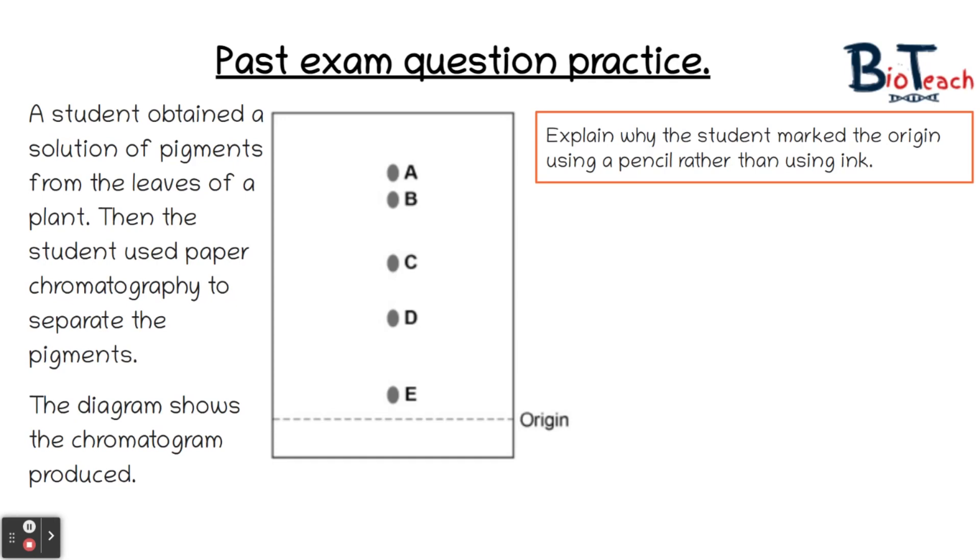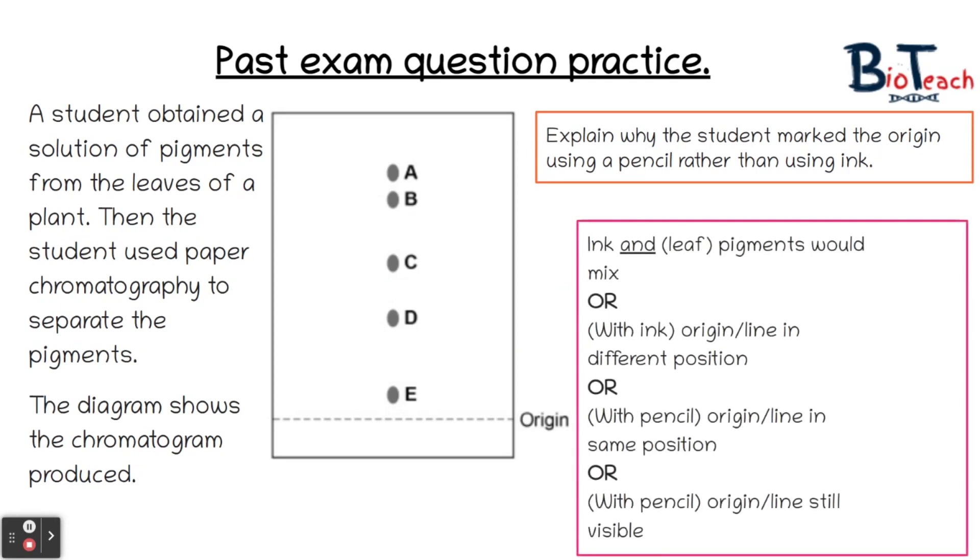If you remember from doing the chromatogram, the solvent will pass through the line of origin. If you drew the line of origin in pen then the solvent would basically carry the ink all the way through the chromatogram and it would mix with the leaf pigments. So we don't want that to happen. So the answer as to why the student marked the origin using pencil rather than using ink is to say that we are preventing the mixing of the ink and the leaf pigments. We are ensuring that the pencil line is also still visible. If you used an ink pen to draw the line of origin then the solvent would carry the ink away and you would not be able to see the line of origin, whereas with a pencil there's no pigments in there so that pencil line stays visible to us during the course of the experiment.